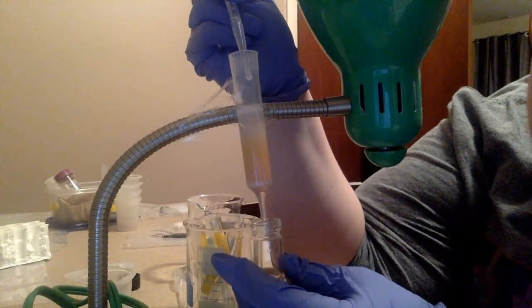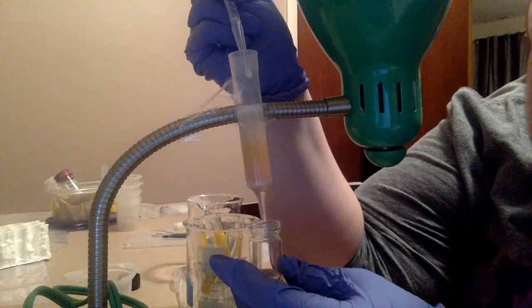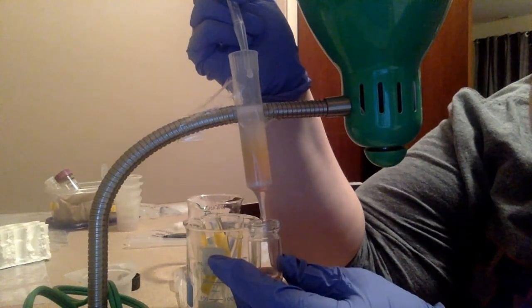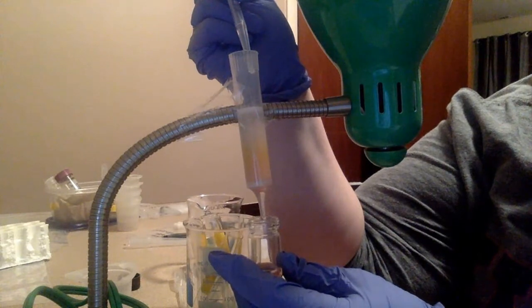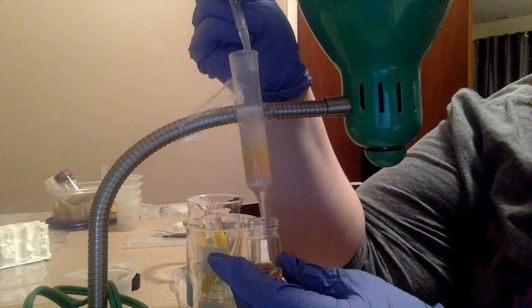So again, gel filtration chromatography separates molecules based on their size. The largest substances come out first. So the blue that I have collected, that would be the largest because it came out first. This pink would be middle in size because it's coming out second.